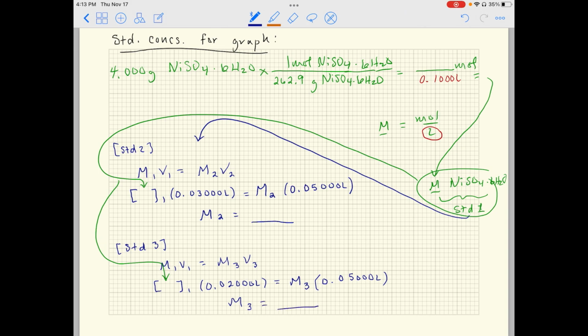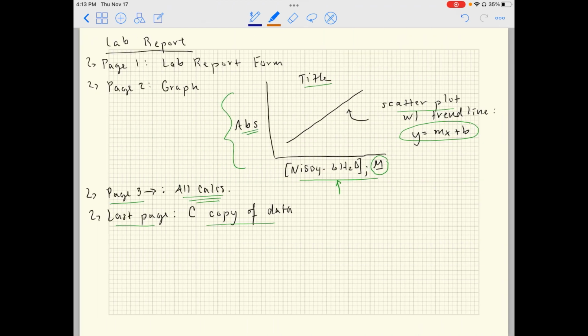You're going to do the same again, but for the next one, for 4, you're going to put 10 there, and then you're going to keep going, and this is the number that's always going to change, and then you'll get a new concentration. So you'll get all those concentrations. You'll plot those against their absorbance, which you have right here, and that's going to get you to that curve. Now that you have that actual curve there, your absorbance versus concentration, you're going to use that information. That's why you need the trend line in order to figure out how much unknown we have.